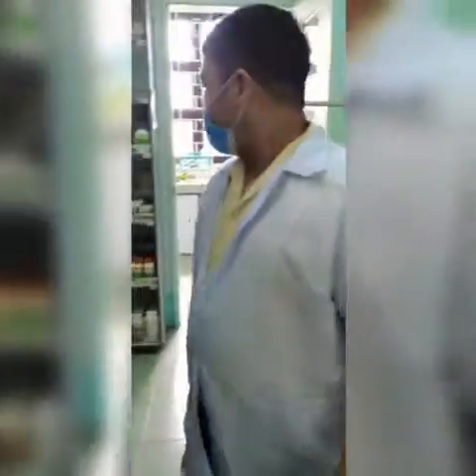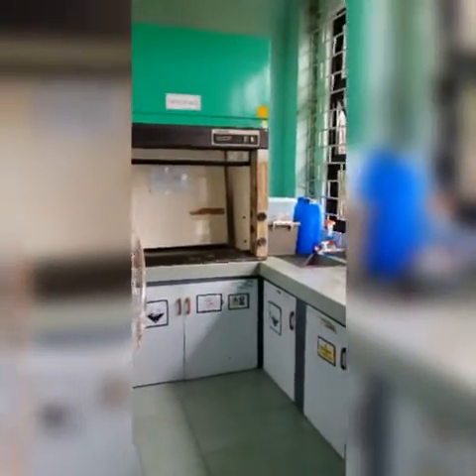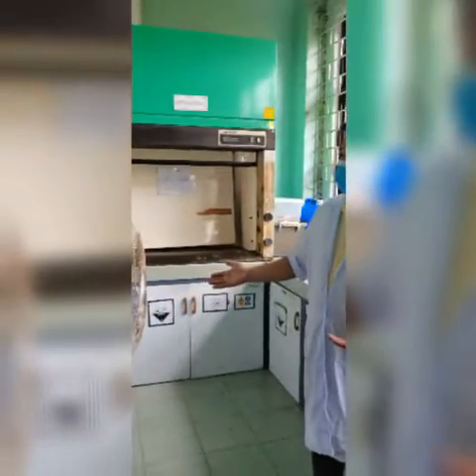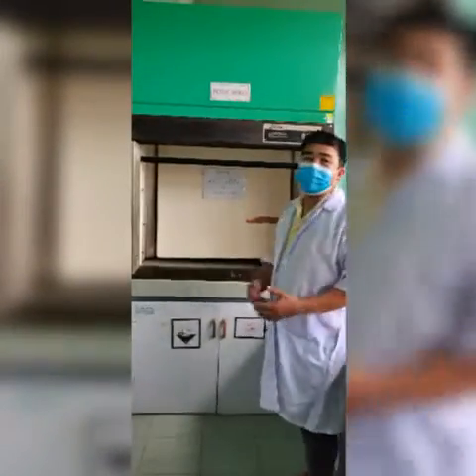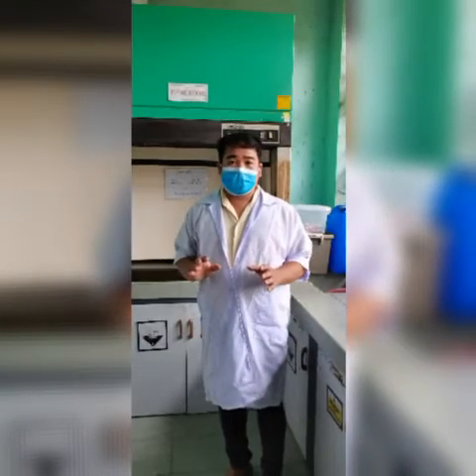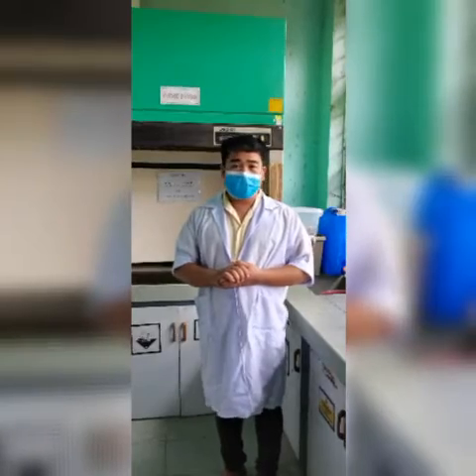And here at the back, you will find this area where the in charge is working or making preparations of the chemicals. So basically, this is the preparation or the working area. In this space, you can also find the chemical fume hood, which safeguards the health of the in charge. This equipment absorbs the noxious or harmful chemicals in order to eliminate the noxious fumes to prevent danger to the in charge or the person working in this space.